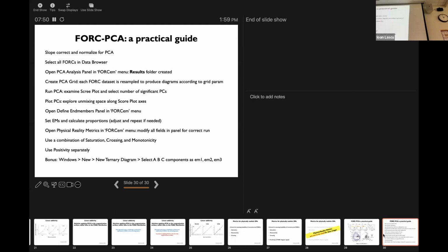As a very simple case, imagine some magnetic mineral is being blown into the ocean that is then causing the formation of magnetotactic bacteria. Those things will always co-vary together. So you see that detrital component and that magnetofossil component in the same end member, and they're genetically linked to each other. So it's pulling out genetically linked end members rather than pure minerals or pure domain states. Hopefully that helps you interpret the process rather than simply saying that's magnetite, that's hematite. Yeah, especially if you're after the process that generates your assemblage.